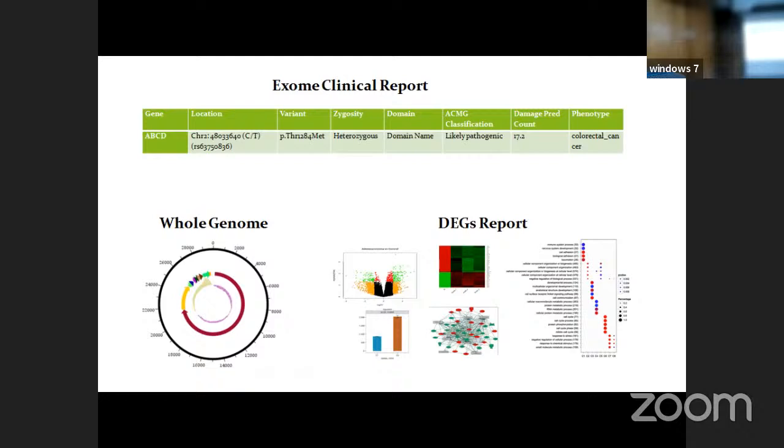For 5,000 genes, if you identify pathways one by one, it will take 6 months. And again, to compile them, that 5 genes are from a particular pathway, 10 genes from another pathway, it will take another 6 months. One year you will take for only annotation. But a bioinformatician can do annotation within 5 minutes for 5,000 genes. Now he has done your 1 year's work in 5 minutes.